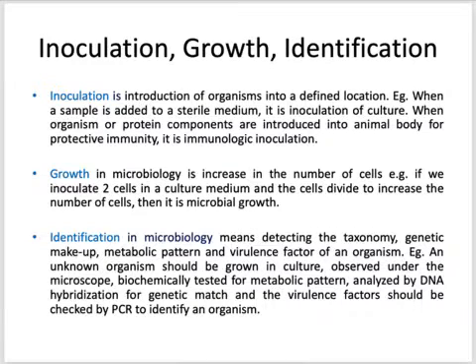What is inoculation? Inoculation is introduction of organisms into a defined location. For example, when a sample is added to a sterile medium, it is inoculation of culture. When organisms or protein components are introduced into an animal body for protective immunity, it is immunological inoculation.